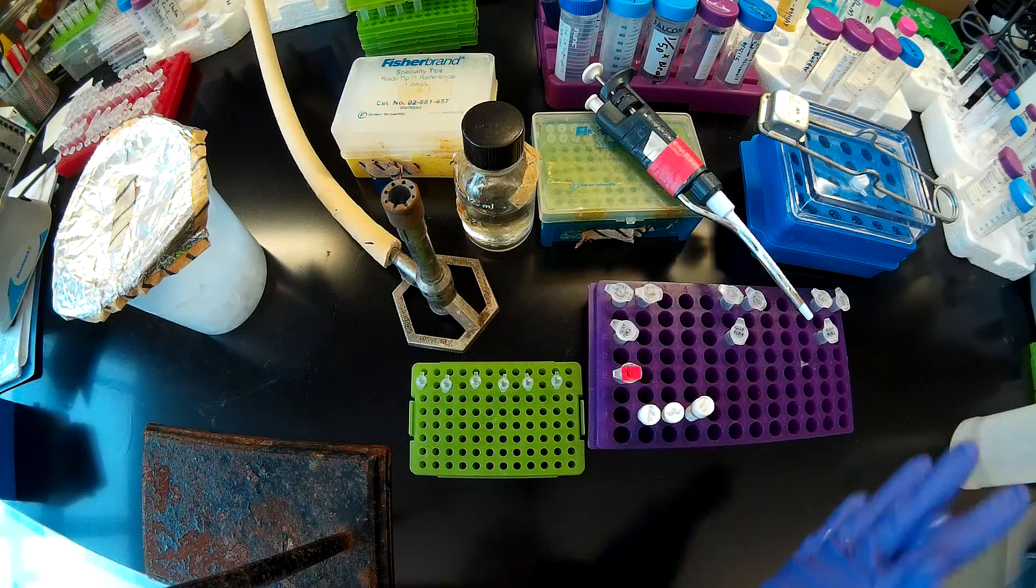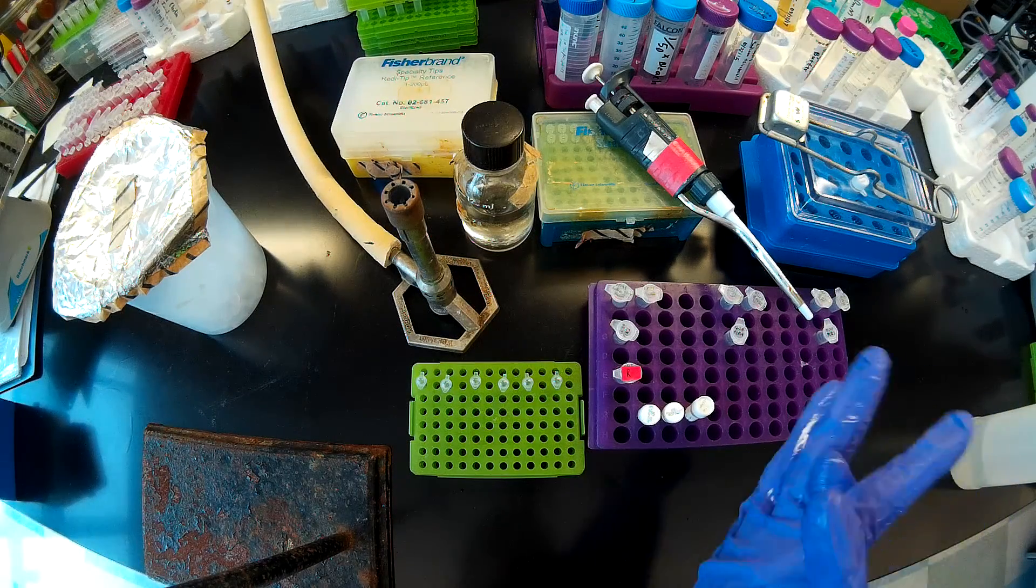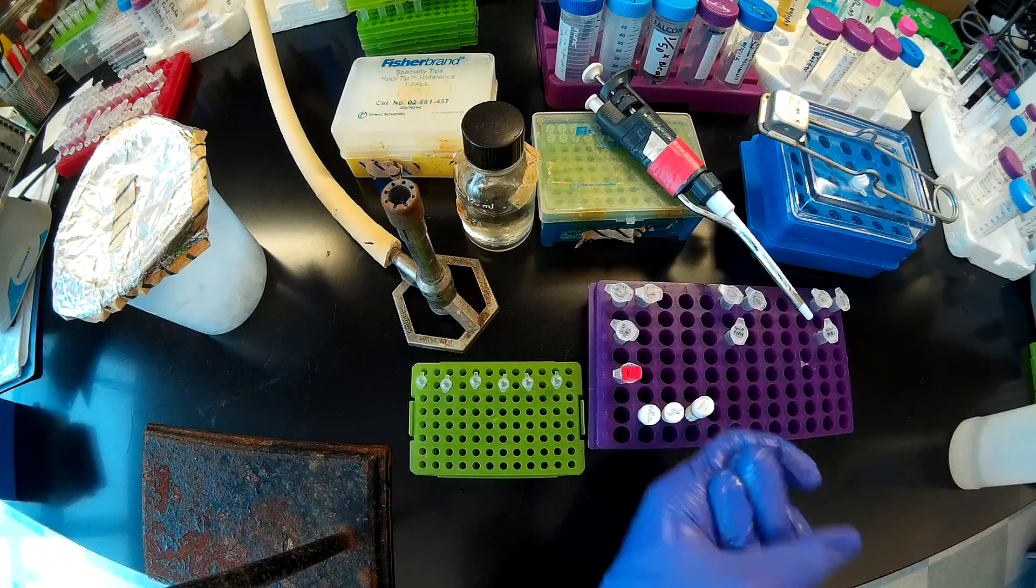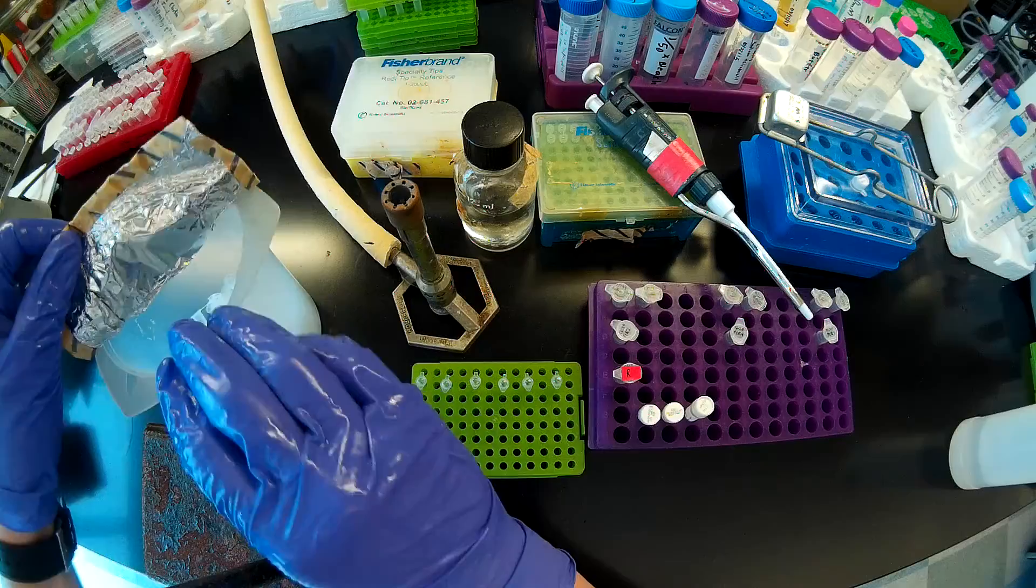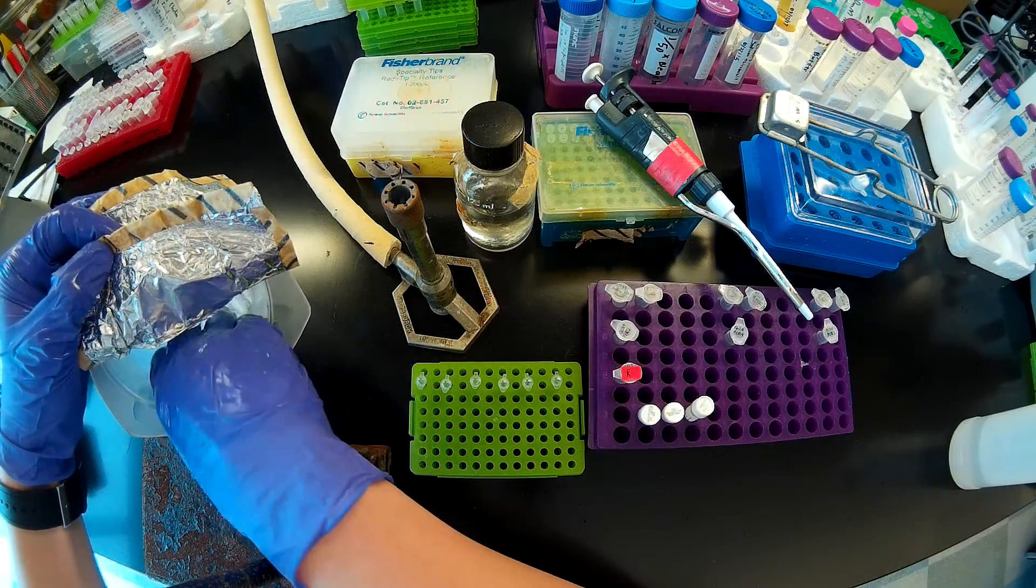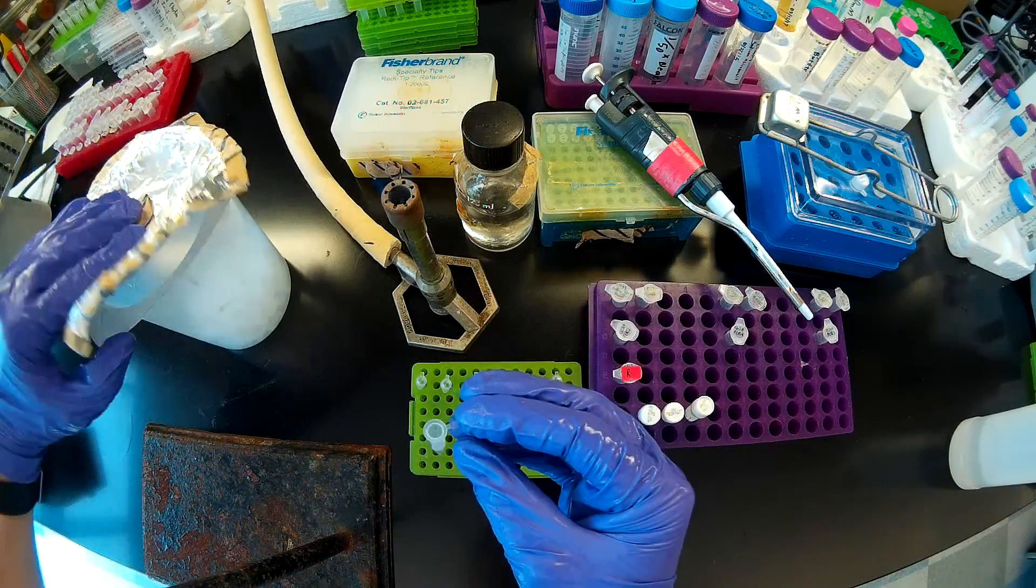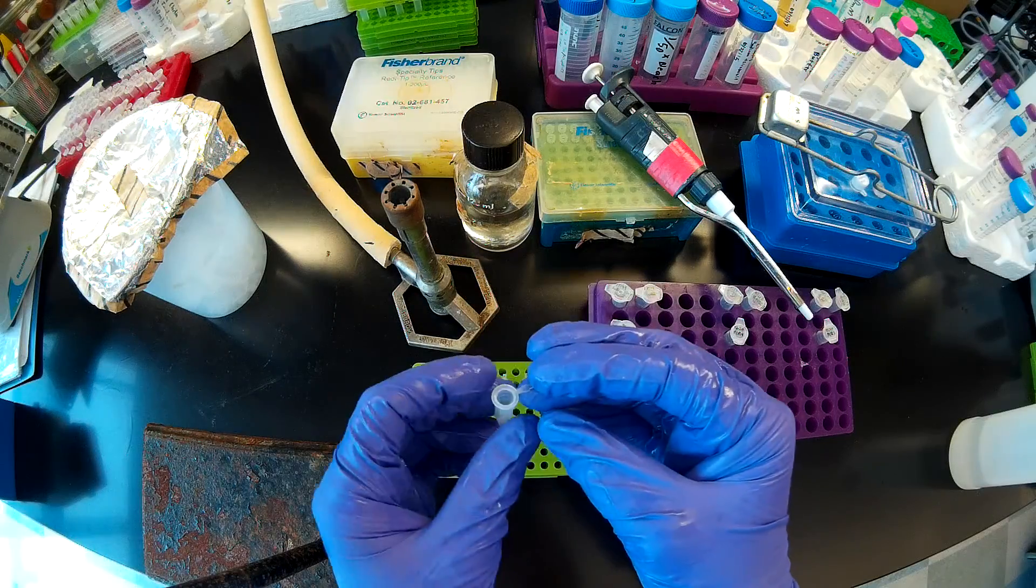First I'm going to grab a sterile 0.6 mil tube to set up my master mix, which is why I'm ethanol-ing my gloves off before I reach into this autoclave beaker here. I'll pull out one sterile tube to set up my master mix.